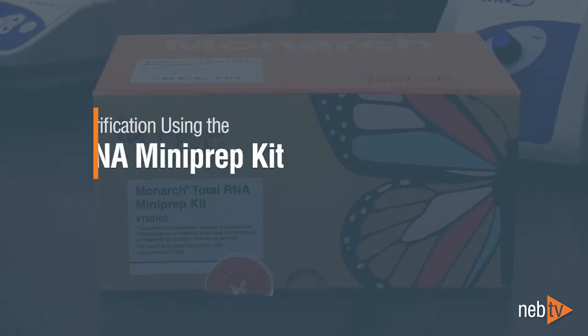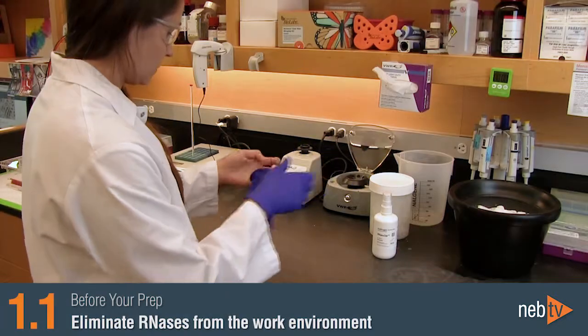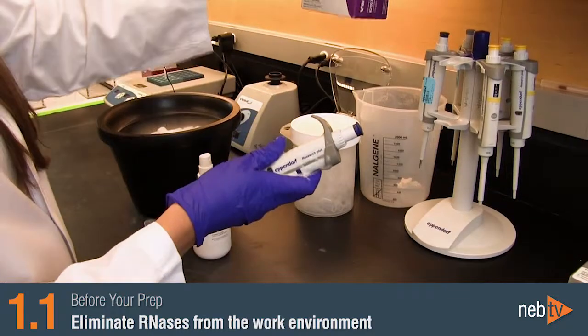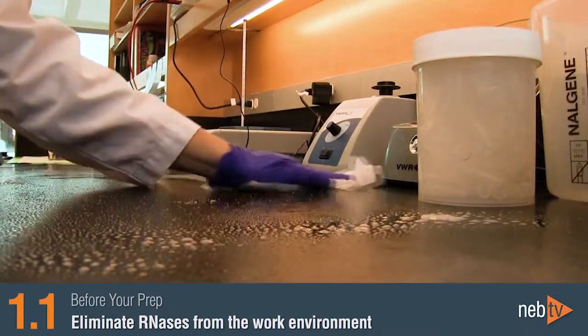Successful RNA purification using the Monarch Total RNA Miniprep Kit can easily be accomplished by following these helpful tips. Before your prep, it is important to work in an environment free from RNases. Always wear gloves, use RNase-free glass and plasticware, and clean your work areas. We recommend wiping your benchtop with a cleaning agent such as RNase Zap.